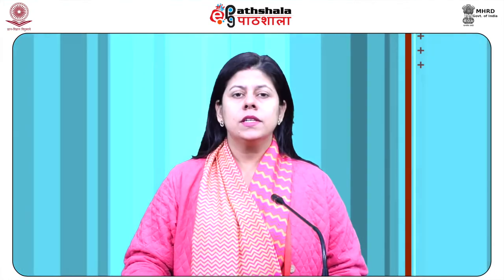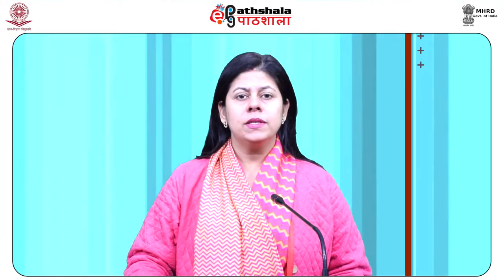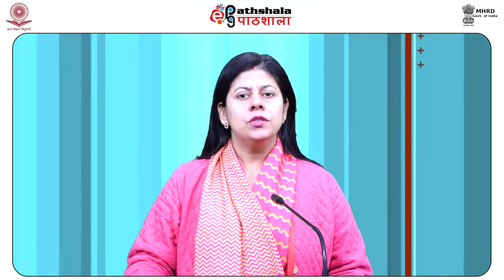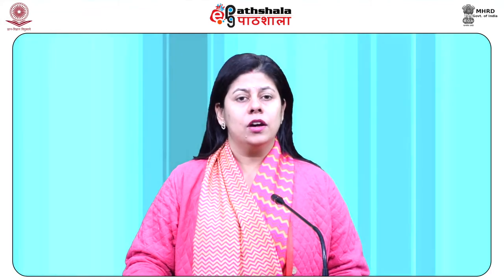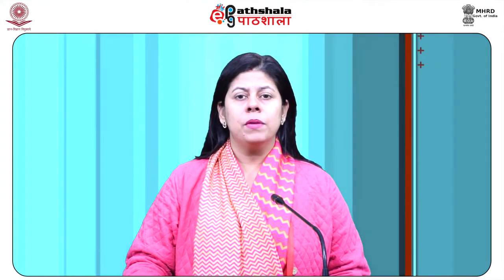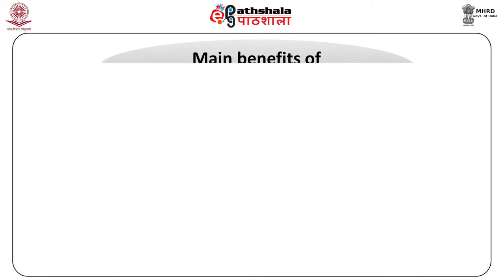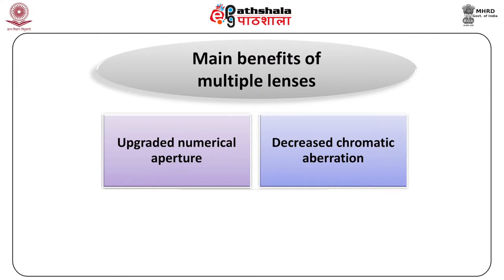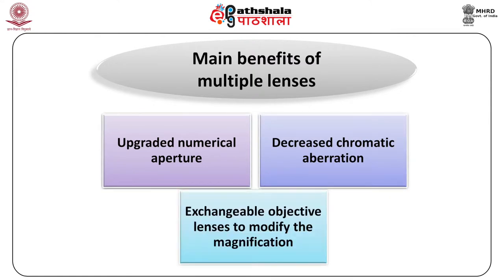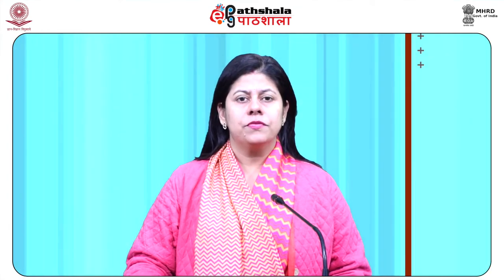Compound microscope. It is a type of microscope which utilizes multiple lenses in order to collect the light from the sample and then to focus the light into the eye. Separate sets of lenses are used. These microscopes are heavier, larger and more expensive compared to simple microscopes because of the increase in the number of lenses used in construction. The main benefits of multiple lenses are improved numerical aperture, decreased chromatic aberration and exchangeable objective lenses to modify the magnification. A compound microscope also makes possible more advanced illumination setups such as phase contrast.